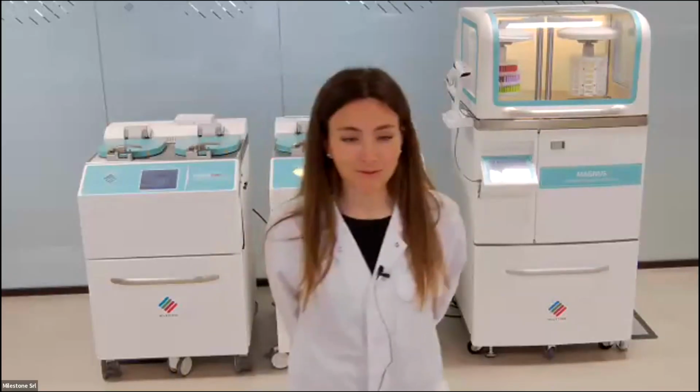Okay, let's continue with another one. We have an attendee who says, you said that the samples are divided by thickness. My laboratory is small and we process all the samples together. With your processor, is it possible to do this or only divided? Thank you for this question.